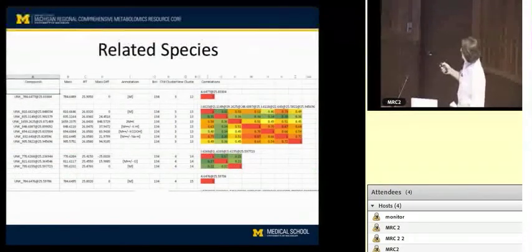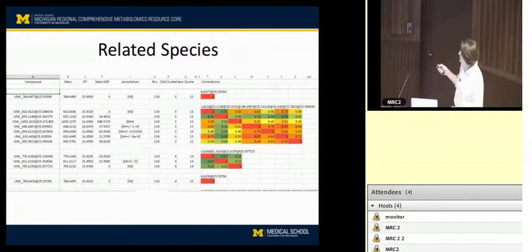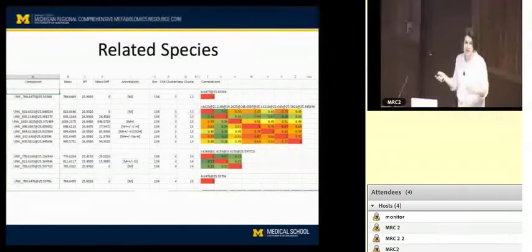Another thing that's really interesting about the software, and is surfacing more and more as we look at this data, is that there's a lot of chemical information here that we're going to be able to take advantage of. As we talk about trying to identify some of these unknowns, by reducing the data, we're getting the targets down to things that we know are probably real metabolites of interest, meaning things you can do a database search on and probably find a match for.